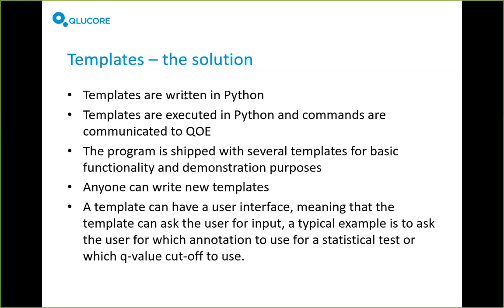So there's nothing you really have to configure yourself, although you can if you want to, because if you want to have your own Python installation, that's perfectly possible. And basically anyone can write new templates. I won't go into detail on writing templates today. That's something I'll save for the webinar on that. However, I would argue that anyone with basic programming skills can learn to do this.